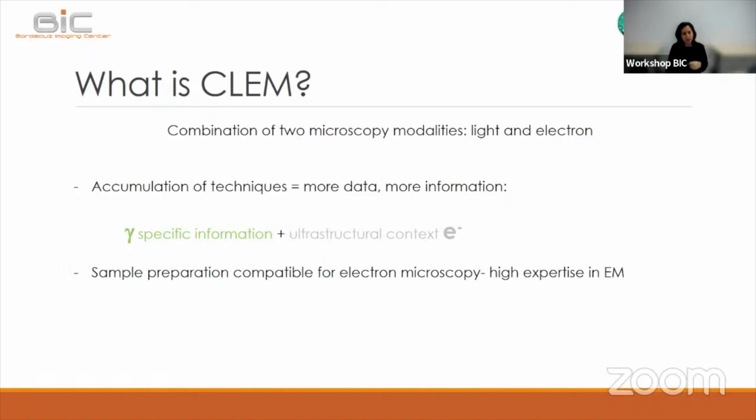As you can imagine, the sample preparation for this kind of method needs to be compatible with electron microscopy sample preparation. So most of the people that develop these methods have really high expertise in electron microscopy. The only drawback of this method, which is not trivial, is that it's very time consuming and can be pretty expensive because of the equipment you need. And if you don't have this kind of equipment in your labs, it's not cheap.